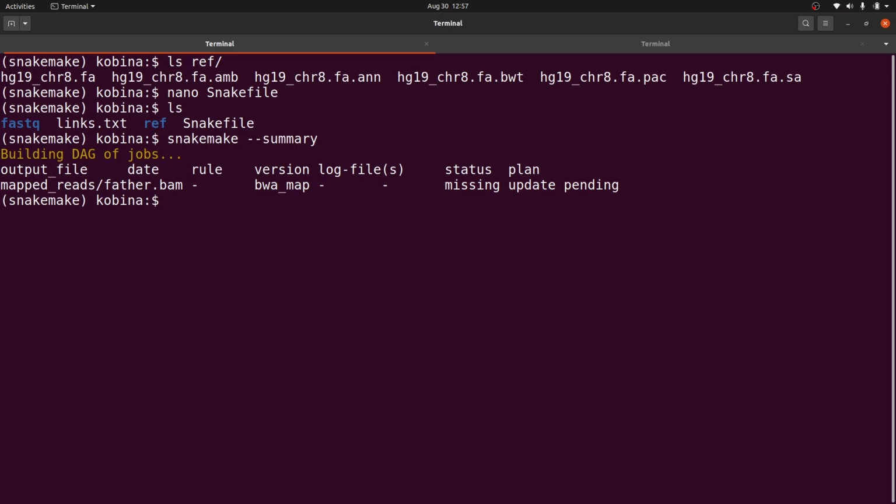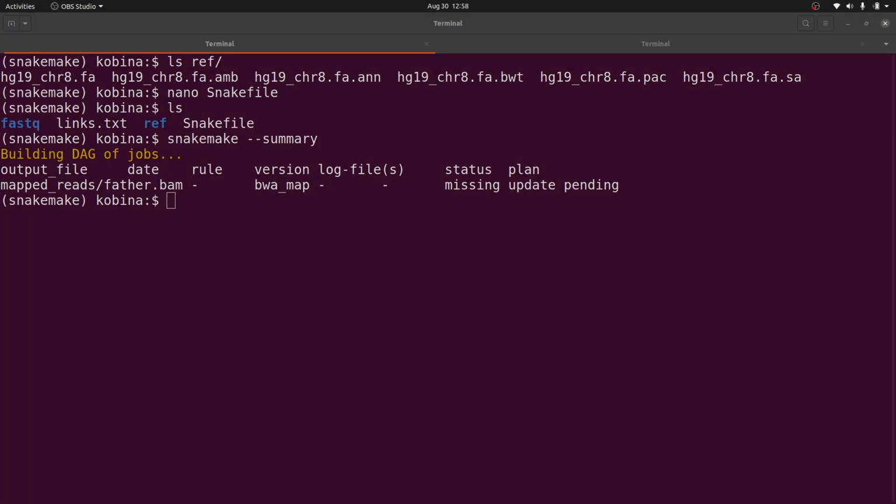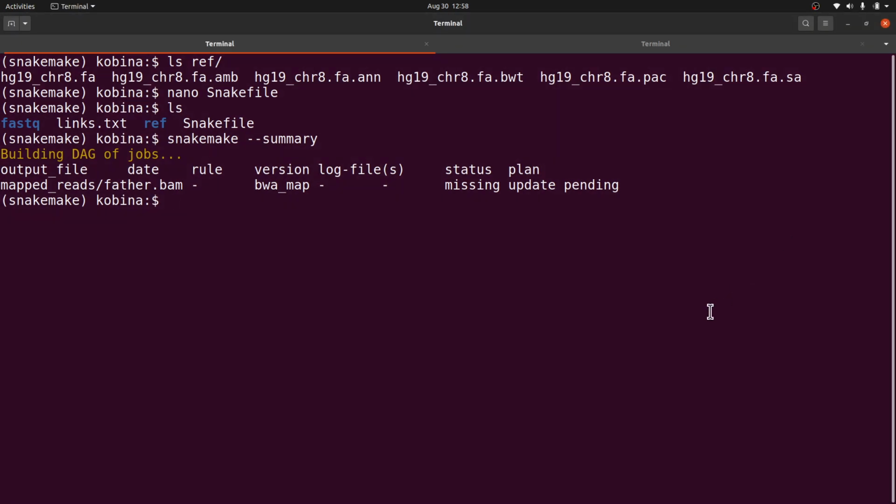Okay, so for now, let's do a dry run. It's like this. Let's just do it. So you say snakemake -n, and I'll say -p. Of course, the -p may not be necessary. It is the -n which is more important if you are doing a dry run, but I'll just add this to it. And then let's execute this command. Let's see what comes up.